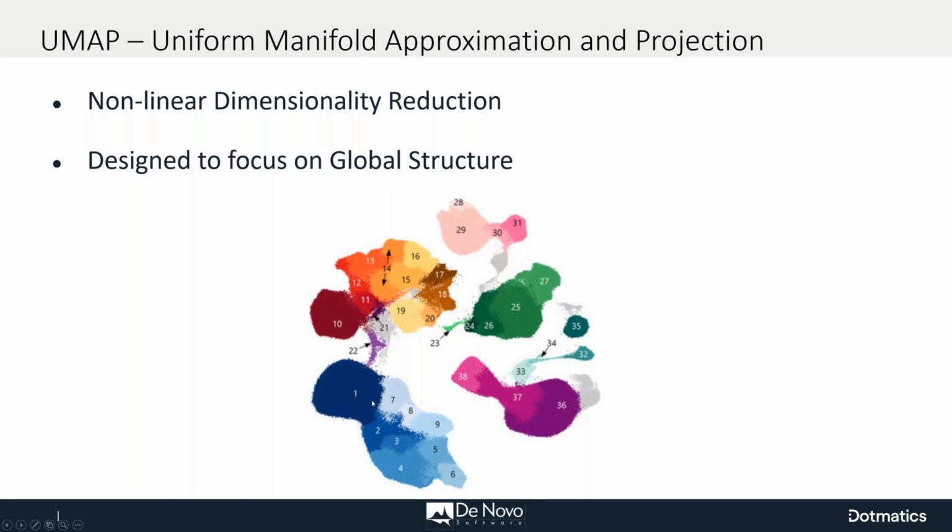So for instance, this is the CD4 island right here. And these little subsections here are the CD45 RA positive and negative, but CD25 positive, CD127 low Treg-like cells. You'll notice they're just on one side of this island. They're not separated entirely, because they're only different from a lot of the other cell subsets in this particular panel by their expression of CD25 and CD127. So they're not different enough in UMAP to break out into their own little islands.